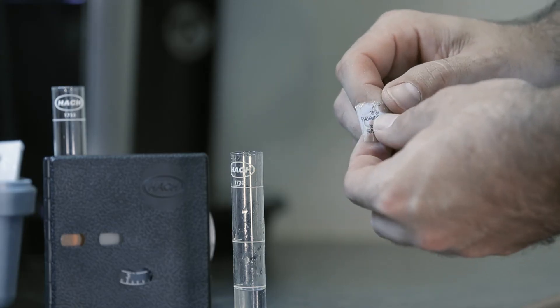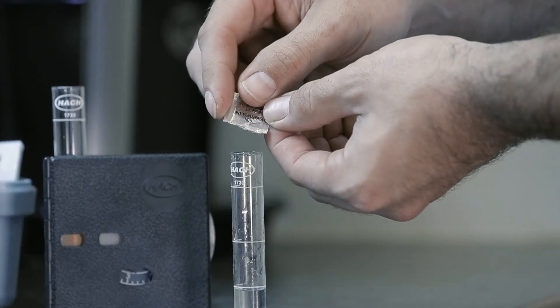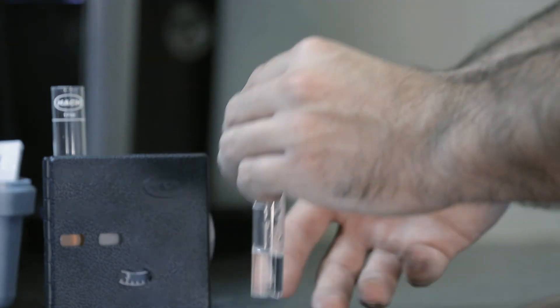In order to test for iron, please use the included iron powder pillows. Simply remove the top, pour the powder into the vial, and then shake.